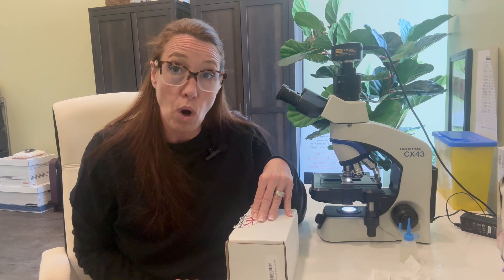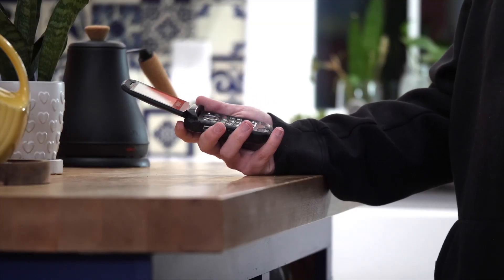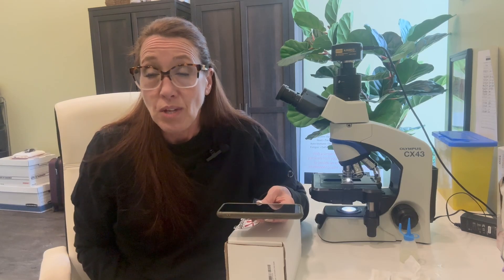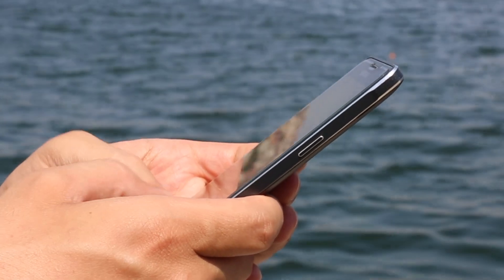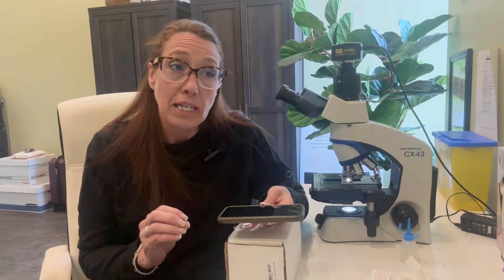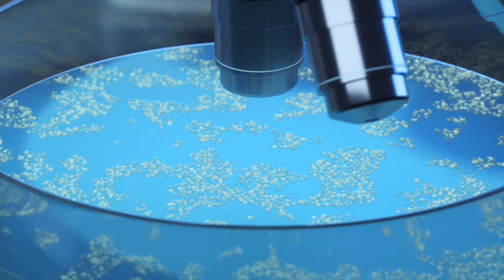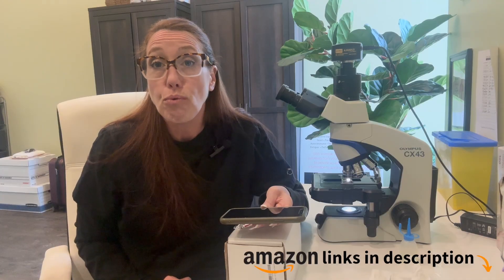One thing I want to note about cell phones: when I started 17 years ago, we had flip phones — we didn't have the glass surfaces that were introduced when iPhones introduced smartphones. The glass surface is a porous area, and bacteria can harbor on these glass surfaces. I do believe there is a correlation to the amount of bacteria we are seeing in people's samples. People don't clean their cell phones and you really should be.